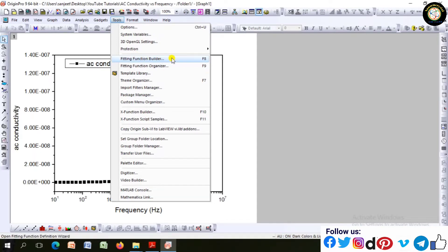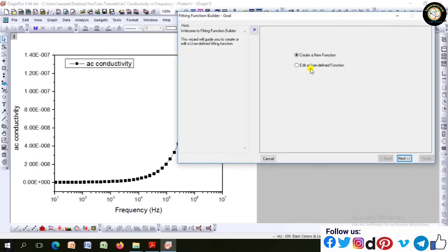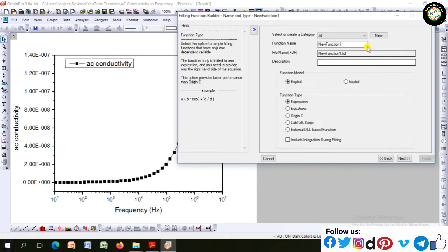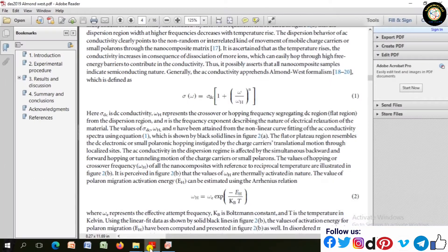From here, go to the Tools function, and after that Fitting Function Builder, and there build up user-defined nonlinear equations — that is the Almond-West formalism.